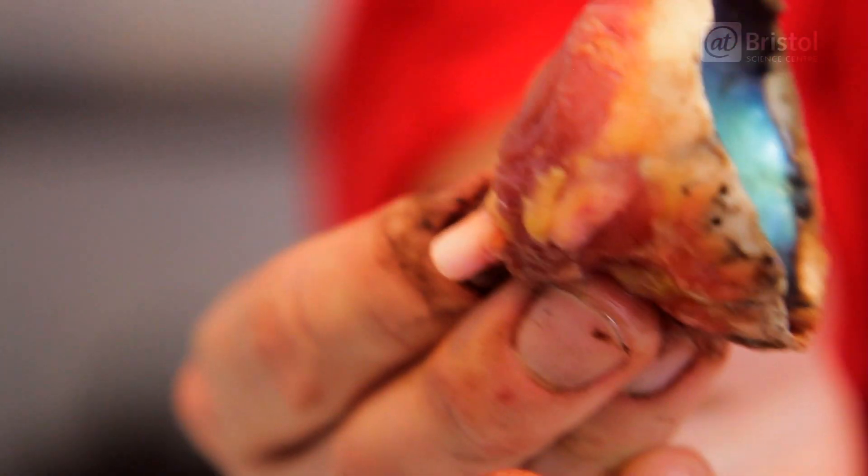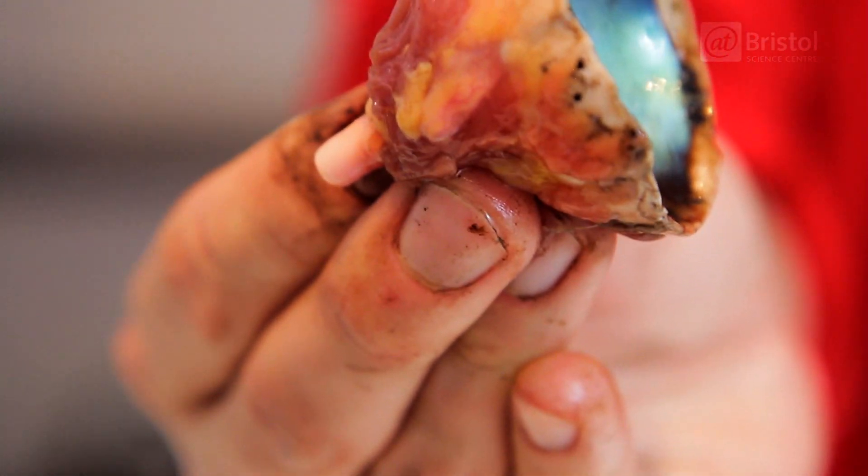The signal passes through, going directly to the brain. So there you have it, a horse eyeball dissection.